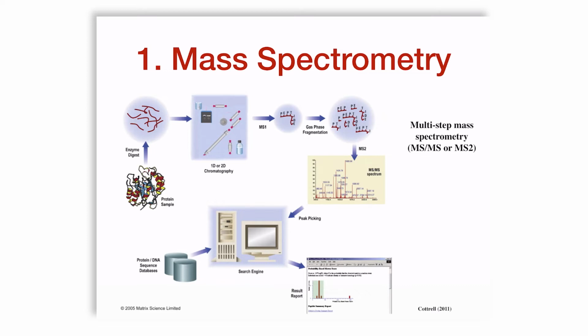The methodology of using these spectral peaks is based on optimizing the enzyme digestion so that the typical size is a few amino acids long of each fragment. This is sometimes referred to as a fingerprint, this spectrum, because it is characteristic for a given protein.